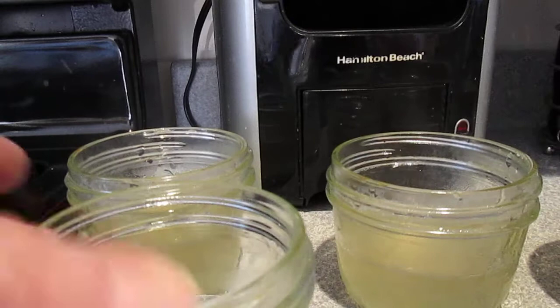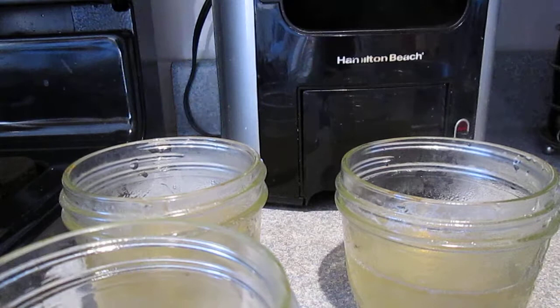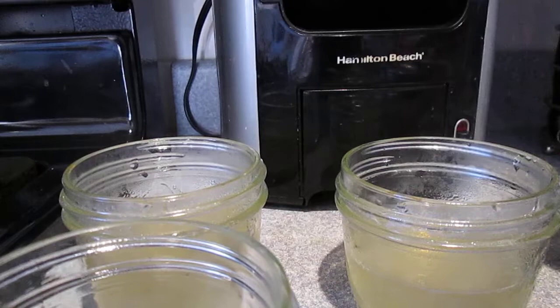I have four half-pint mason jars here — three of them are half full, the other one is about a quarter full. I'm gonna pop the lids on top of those. Just watch out, they're very hot, so be very careful you're not grabbing anywhere where the liquid is on the jar. Pop the lids on these.